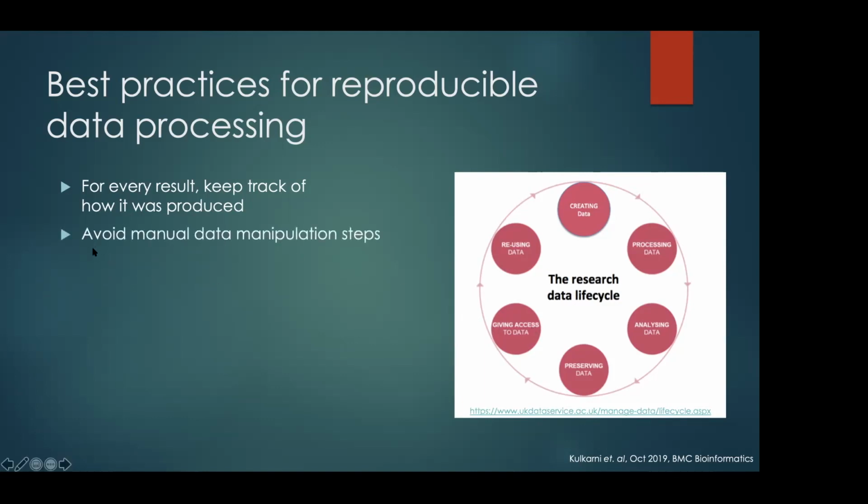And we bioinformaticians always do some manual manipulation steps to do things faster. For example, there's a file, a table, and you just remove one column from the table and create another table. When you do this once, it's okay. But then they ask you for something new, hey, can you map this to this new annotation? And you come to that manual operation, and you have to go there and do it again.